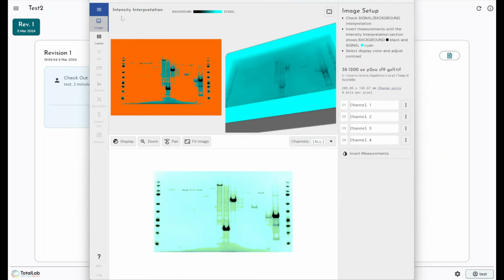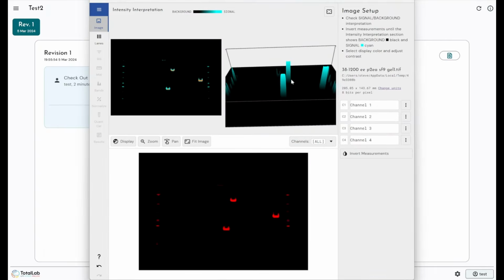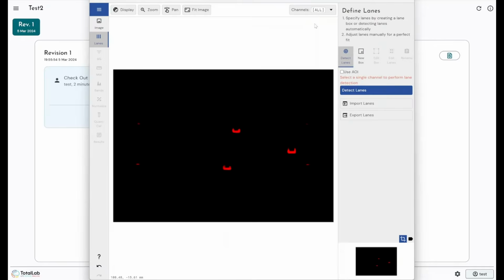Now, I've not got the option to save this image anywhere outside of the AuditSafe software. It lives within the software. So we don't have to worry about it leaving the environment through being saved as. So we've kind of closed the ability for users to do that. So if I just come through, now again, I'm using our software, but by no means is AuditSafe limited to our software. Like I said, we have partnerships with other companies that want to use AuditSafe as the foundation for their own analysis software. So I can come through and do my analysis, whatever that may be. I'm just going to come through and quickly do this.